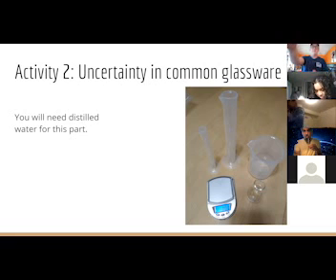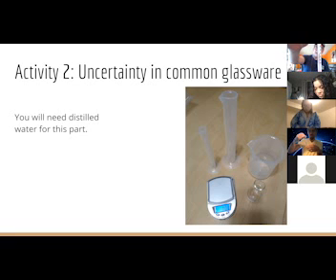And then this would be the bottom that has the liquid in it. So don't worry, this isn't mercury. This is just ethanol, some alcohol solution with some food coloring in it. So not dangerous. More dangerous is that if it breaks, you might poke yourself with it. So we see that your temperature is probably not going to be exactly on one of these tick marks.